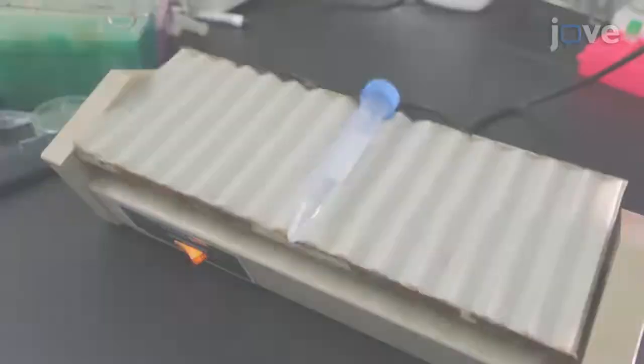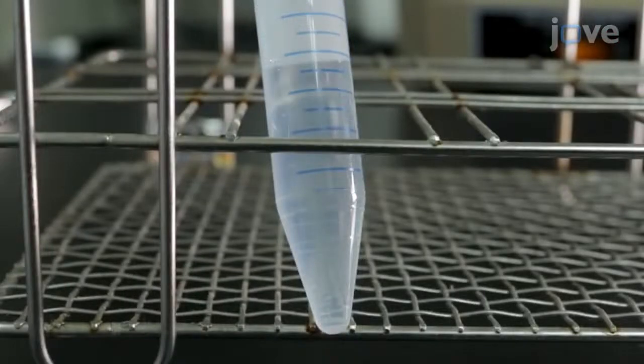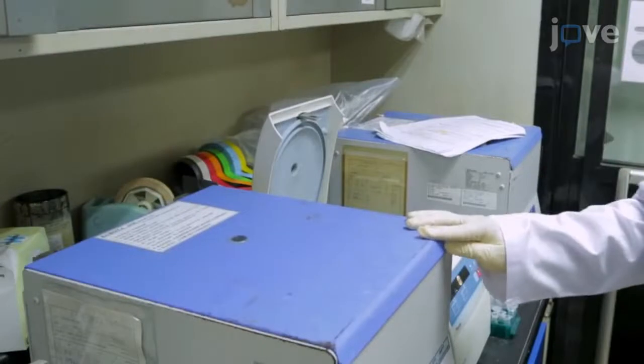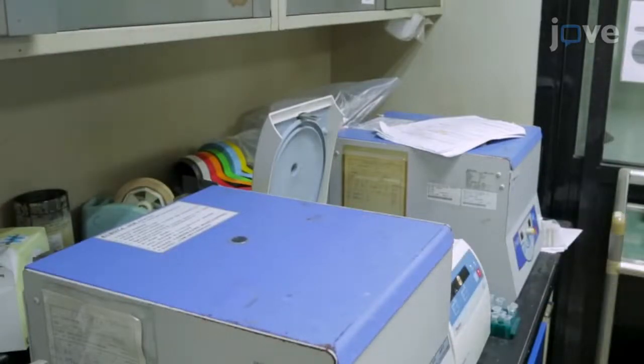After the eggs are released, add 10 mL of deionized water to stop the lysis. Then centrifuge the tube to pull down the eggs and remove as much of the supernatant as possible.